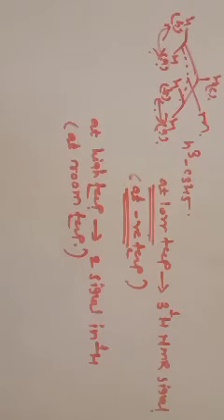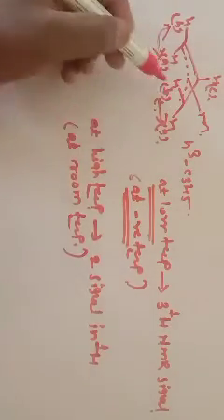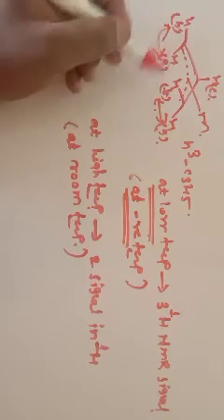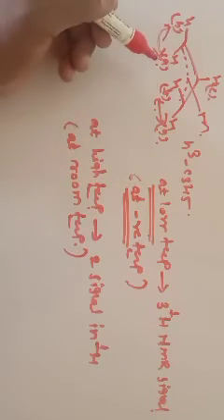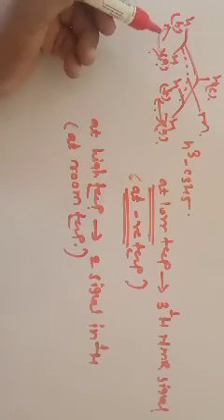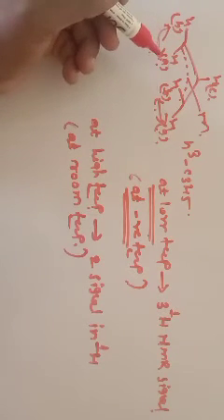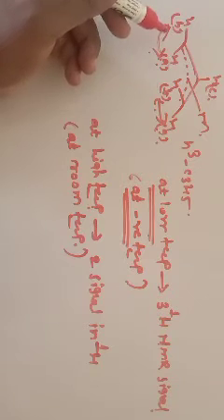So at high temperature we get only two signals, because there is an interconversion of the syn and anti protons. With respect to the metal atom, two protons are syn and two protons are anti, and they are exchanged rapidly.